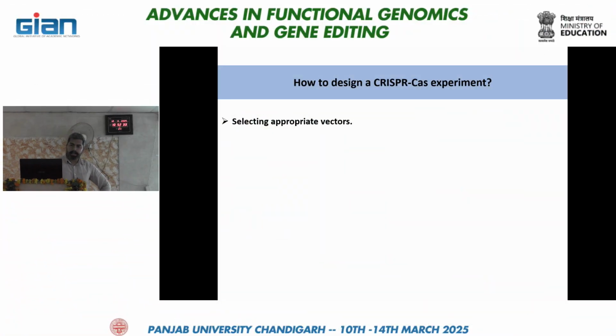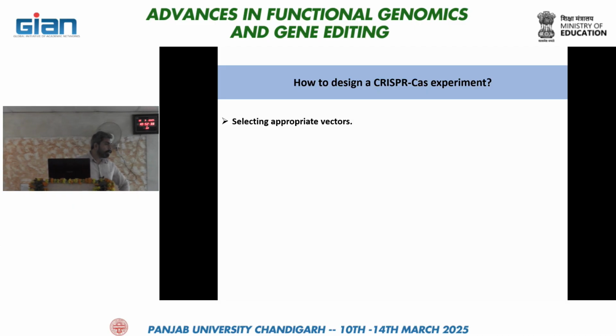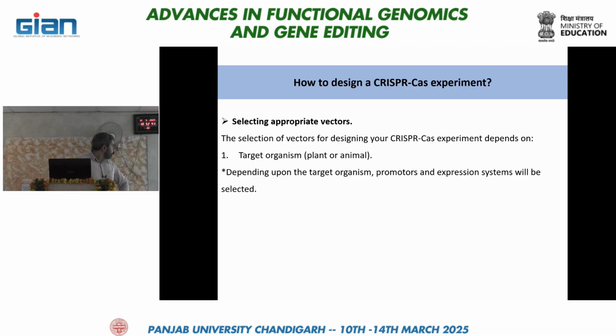Before designing the single guide RNA, you need to first select the appropriate vector, because the selection of vector depends on the target organism which you are planning to target. If you are targeting a plant, then the promoter and the expression cassettes will be different. So you will take the expression cassette specific for plant, and in case of animals, you will take the promoter and the expression cassette specific to that particular organism. This is the thing you should keep in mind first.